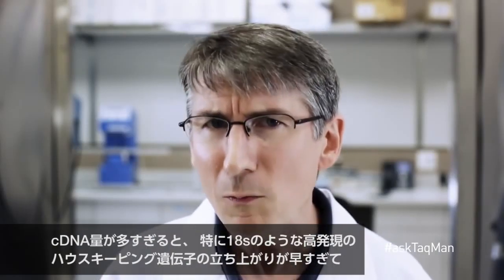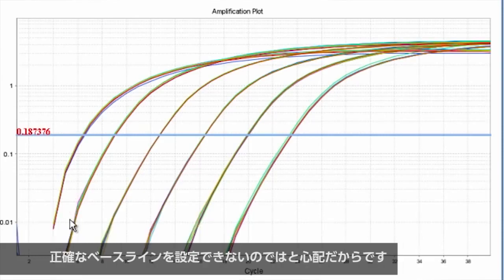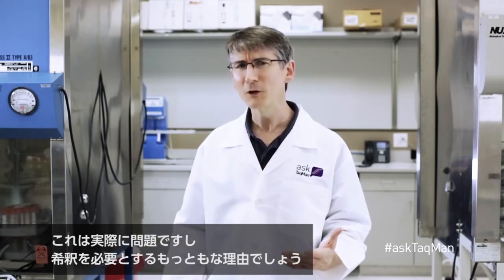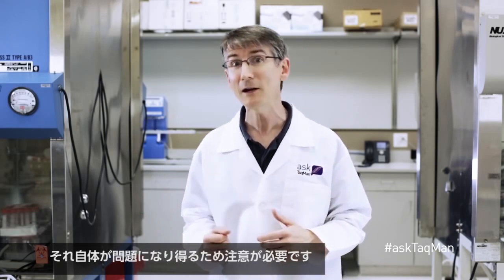There is a second reason people dilute cDNA: the fear that too much cDNA will cause the housekeeping gene — especially if it's a very high expressor like 18S — to appear so early during cycling that an accurate baseline can't be set. This is a real concern and probably a good reason for diluting. Just be sure not to dilute so much that your target gene CTs drift into the mid-30s or later, since this can cause problems of its own. Users always have the option of limiting how much RNA goes into the initial RT reaction.